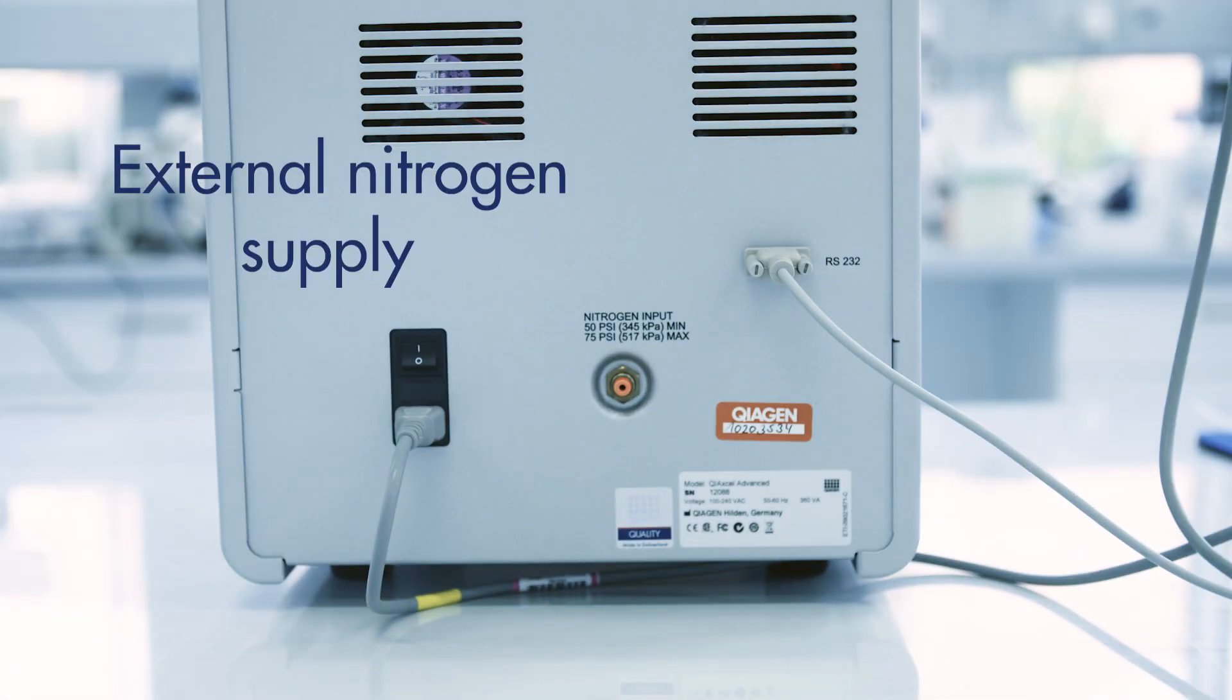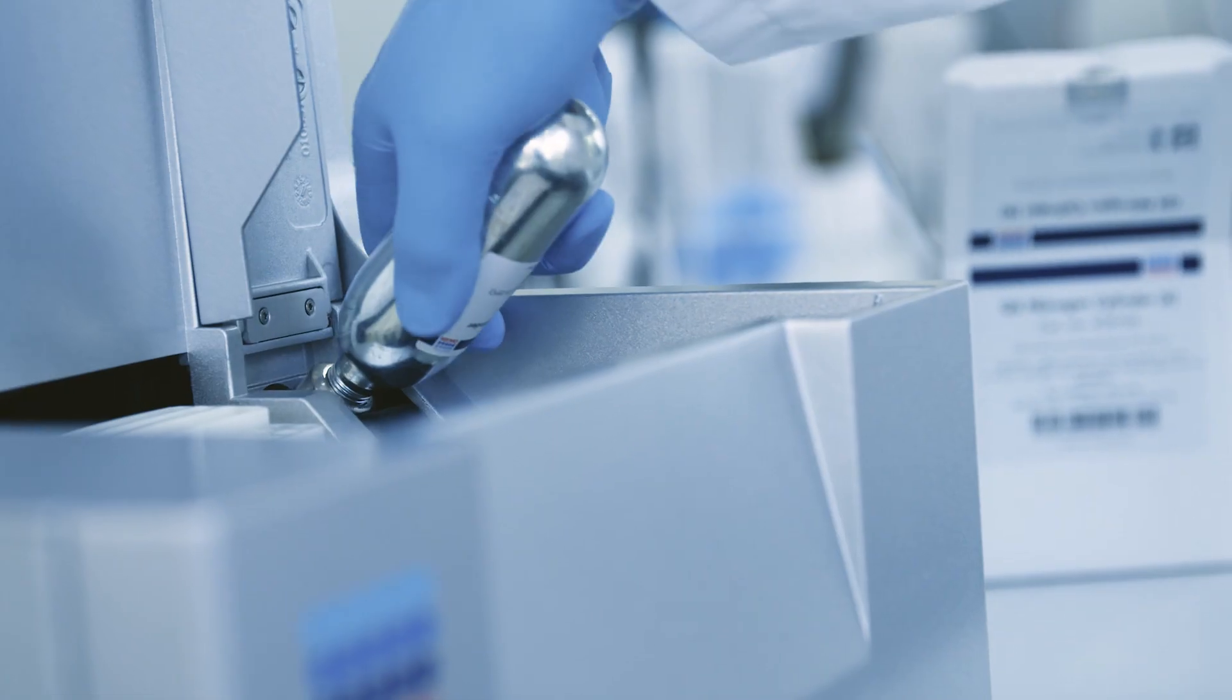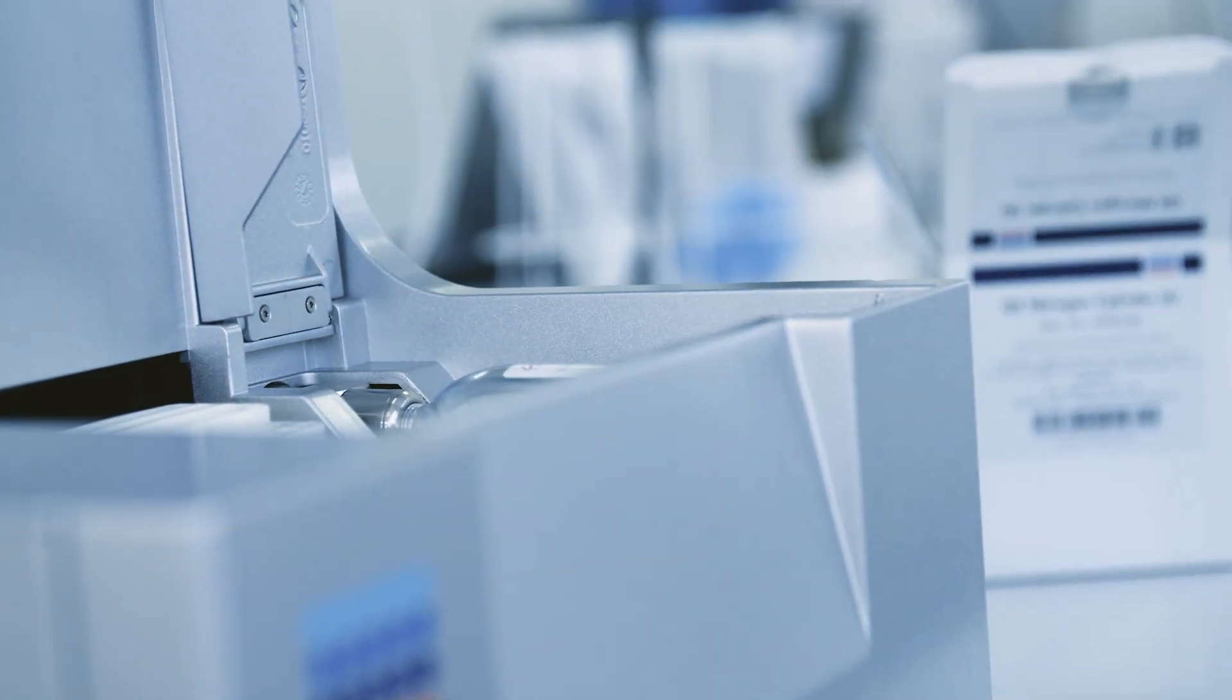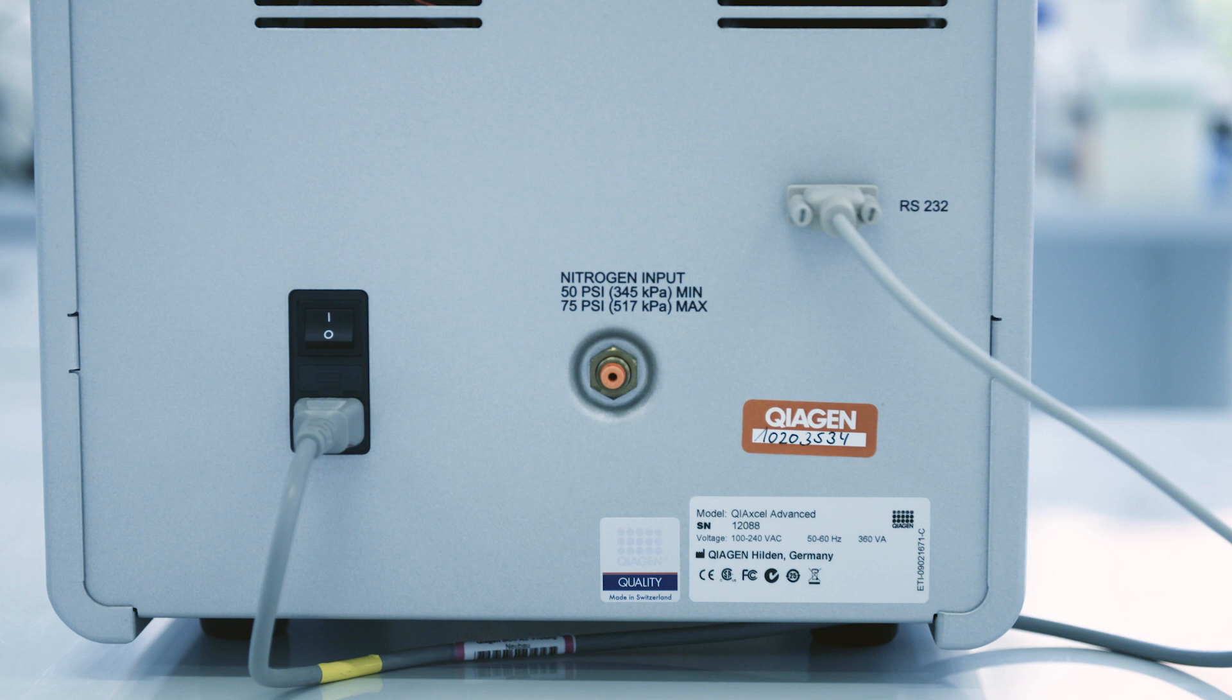Alternatively, you can connect an external nitrogen supply. The instrument requires nitrogen to apply the required system pressure. At the rear of the instrument, the nitrogen port can be used to supply external nitrogen.